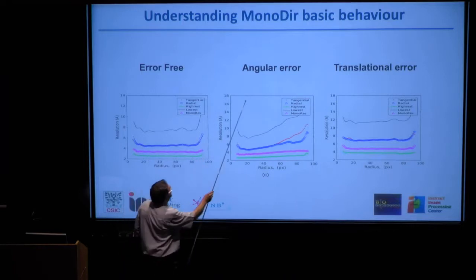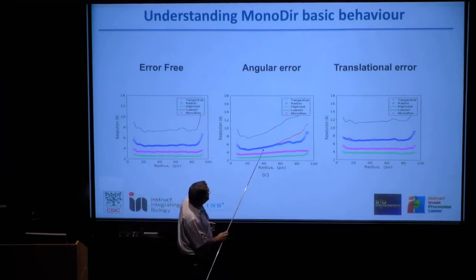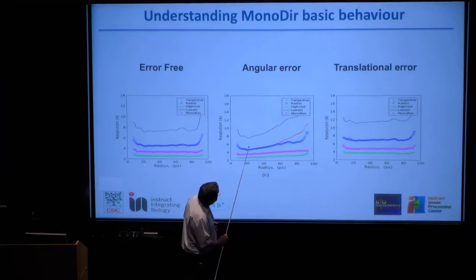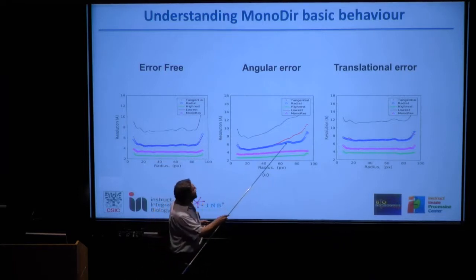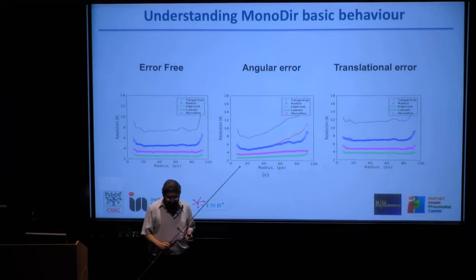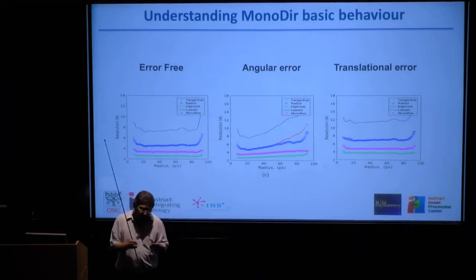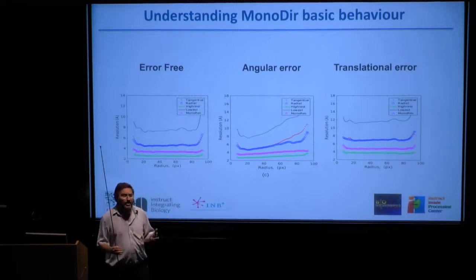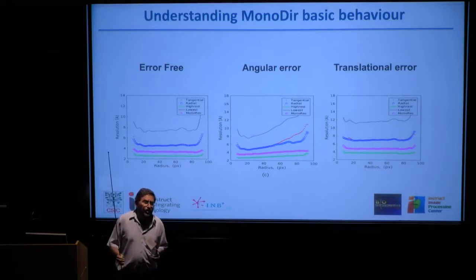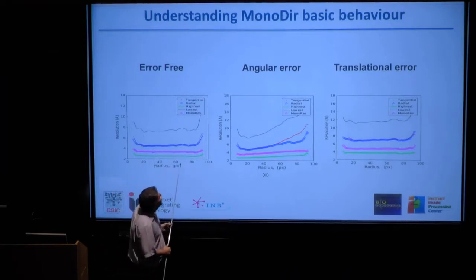Now we introduce an angular error, and we see a curve with a certain slope. These divergences here, this is beta-galactosidase, are related to when I start having more or less pixels that are occupied by areas outside the protein. I mean, it's not a spherical specimen.